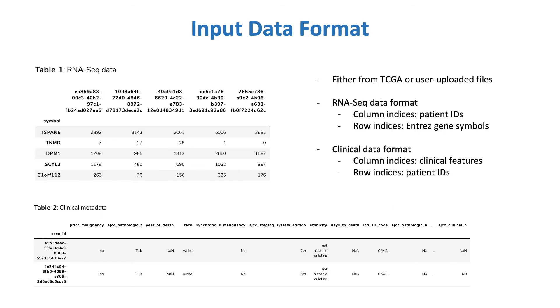The format of the data can be seen here, and is assumed to be the same regardless of whether the dataset comes from TCGA or is user-uploaded. For the RNA-seq data table, the column indices are patient IDs and the row indices are Entrez gene symbols. For the clinical data, the column indices are various clinical features, and the row indices are patient IDs corresponding to those in the RNA-seq data table.